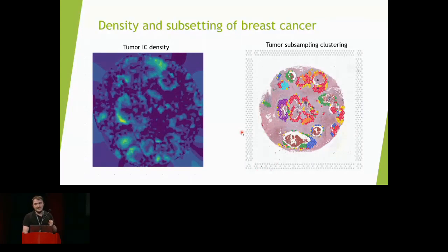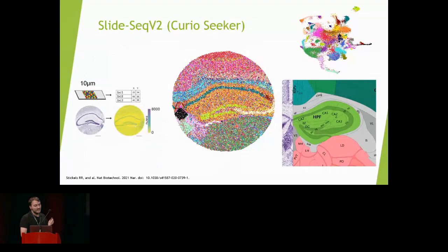So we've not just used this package with the Visium technology, we've also tried to use it with Slide-seq technology, which in terms of analysis and output is very similar to Visium, except at a much higher resolution of 10 micrometers. And as we can see, even if you don't necessarily need to deconvolve a signal, ICA can also be used to detect a very accurate representation of your tissue, here in the mouse hippocampus, compared to the reference which you can see on the right here.